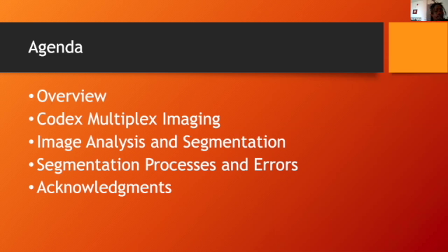So for the agenda, I'll have a brief overview of what the actual task was, where the collection sites were. I'll talk about CODEX multiplex imaging. I'll briefly cover image analysis and segmentation. I'll go over segmentation processes and the errors that occurred, and then I'll have my acknowledgements.